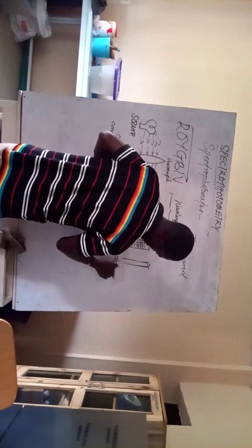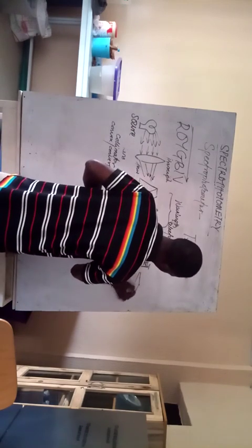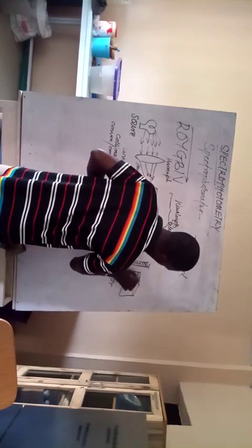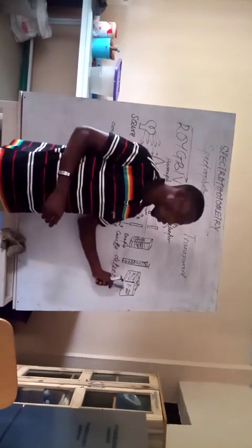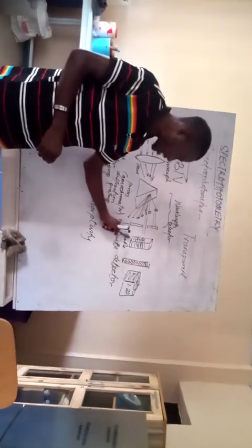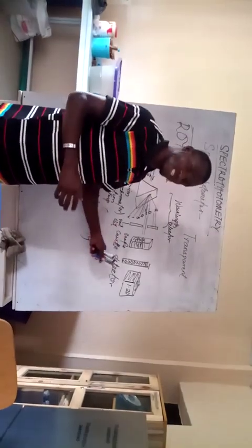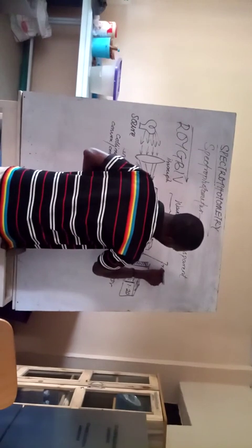So the detector we wrote here the other time is here. This is basically the end point, and a detector now translates this information into digital information and records it. You can have, say, 1.20. And then this becomes the absorbance of this material, because what the detector does is it measures the intensity of light that strikes it. So the intensity of the light that strikes it is actually what is called the transmittance.